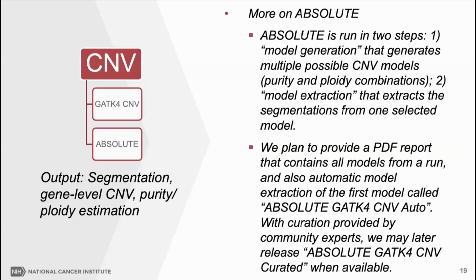And later, if expert manually reviewed models become available, we will release what will be called Absolute GATK4 CNV curated. If both curated and automatic results are available in the portal, the curated one will be the one you should use. It's all preferred high quality data.